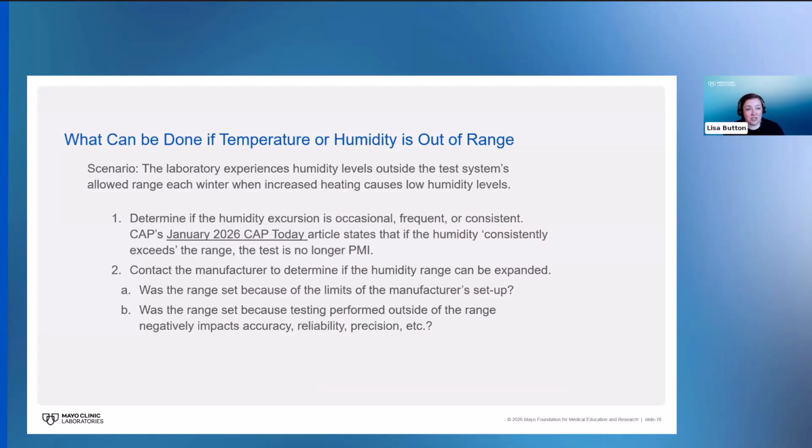I have another scenario to share with you. So in this case, we're going to think about the winter when things get dry. Your scenario is that the laboratory experiences humidity levels outside the test system's allowed range each winter when increased heating causes low humidity levels.